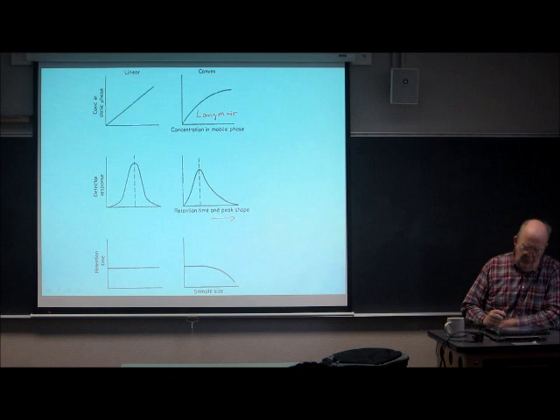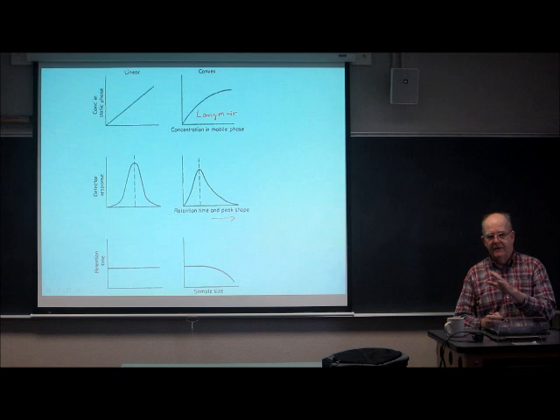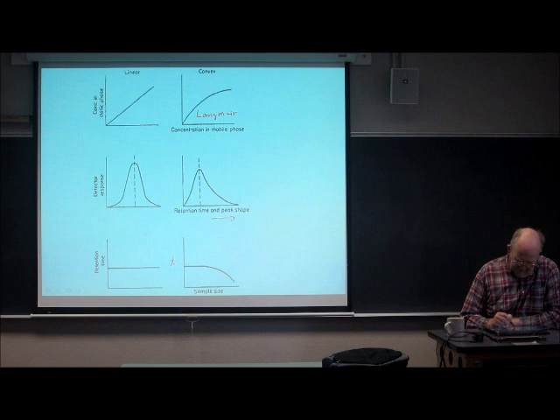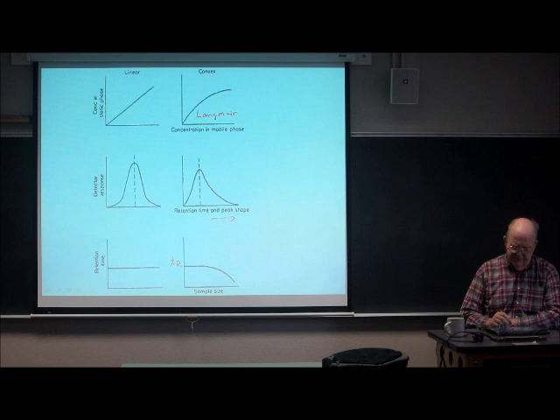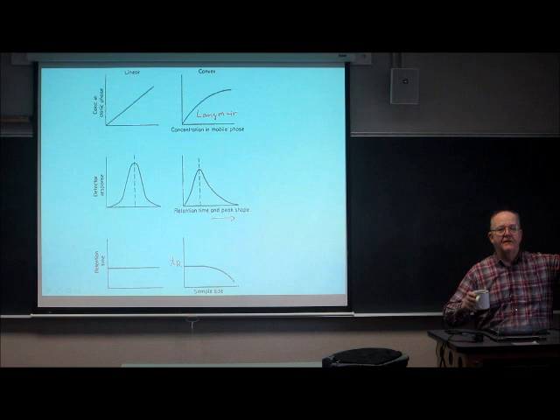What you will find in this instance is that if you inject a lot of stuff, the retention time, the position of the peak maximum, is going to drop. So this is your retention time here. Inject a little bit of stuff, it's constant, but you can inject too much and it starts to come down, and the more you inject, the more that peak moves in until eventually it moves into the dead time of the column.